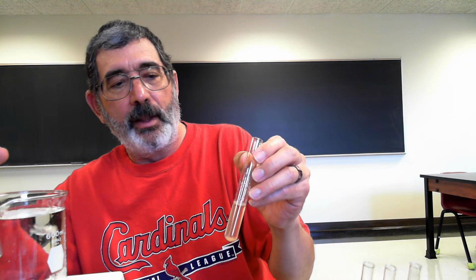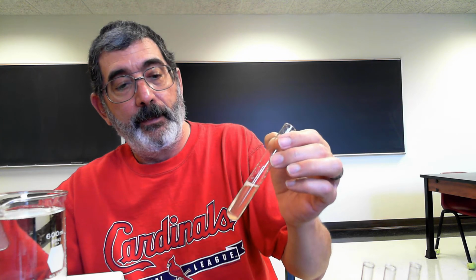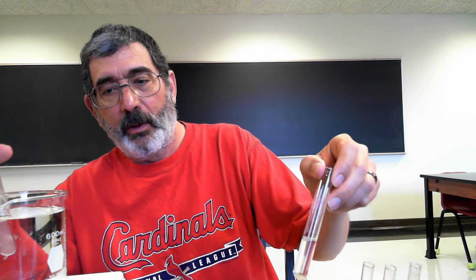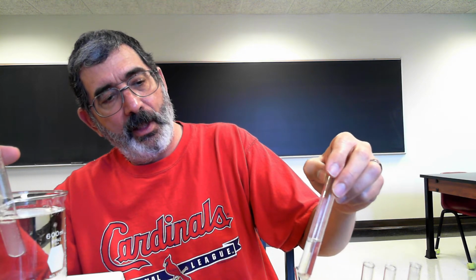Notice we're getting a nice brown product. That tells us that our enzyme is functioning normally. What about the cold water? I'm not seeing much change at all here. In the hot water, maybe looking a little bit more cloudy, but again, I'm not seeing any brown color.